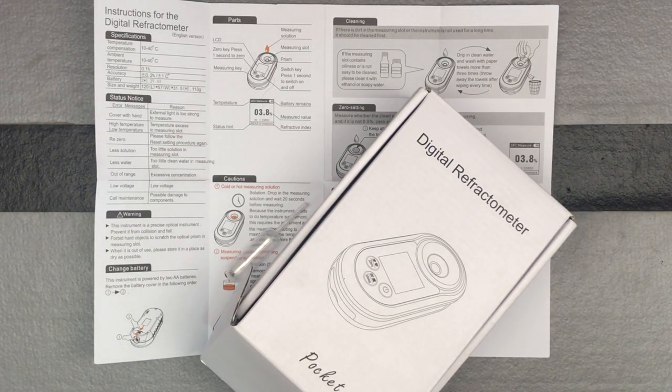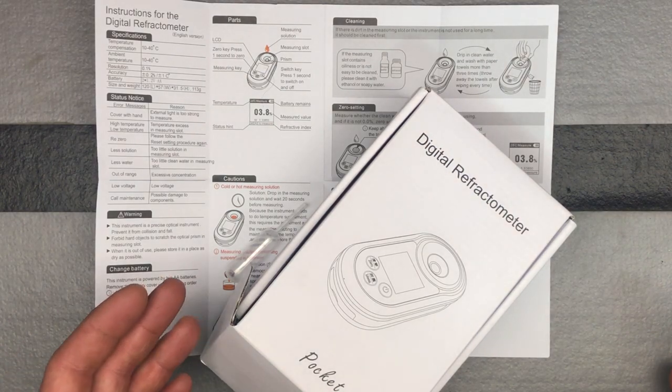Here's something interesting that will come in handy. I try to be very careful about how much sugar I eat and really minimize it. This here is called a digital Brix refractometer from the brand LNICEZ instruments. What it does is allow you to test basically the amount of sugar in liquids or liquid-type food products — jellies, juices, different things like that — and it gives you the refractive index of the sugar content of that watery solution.